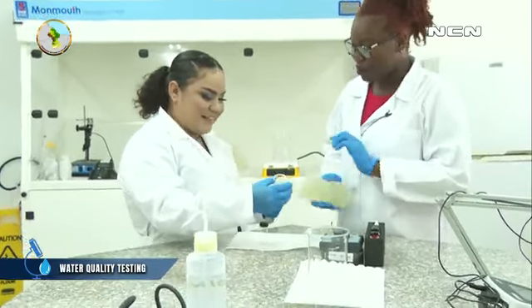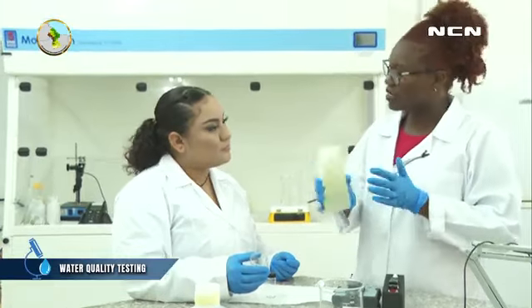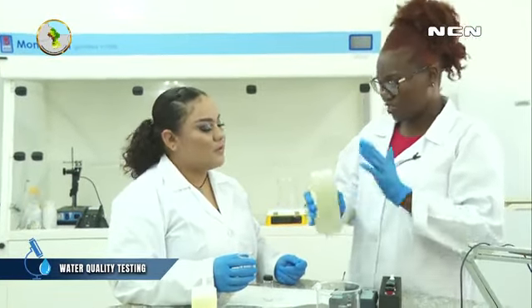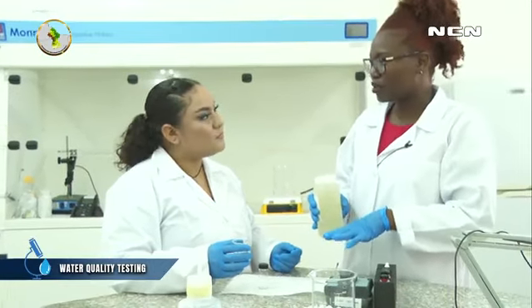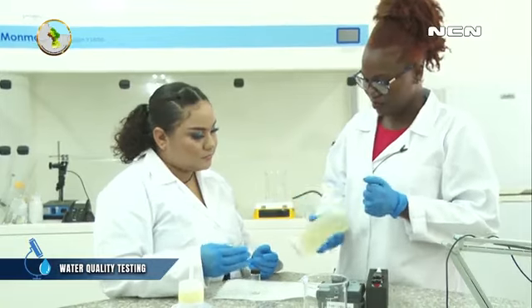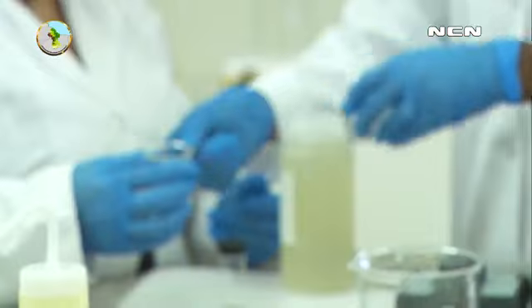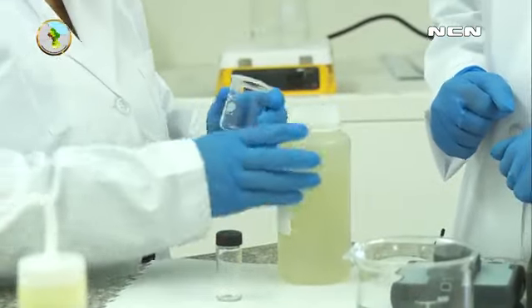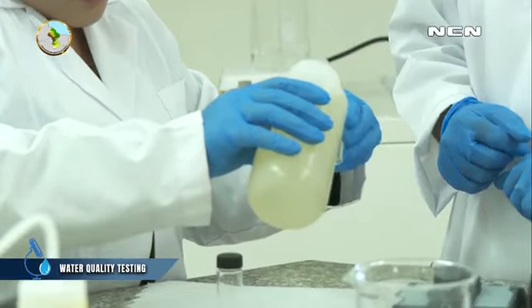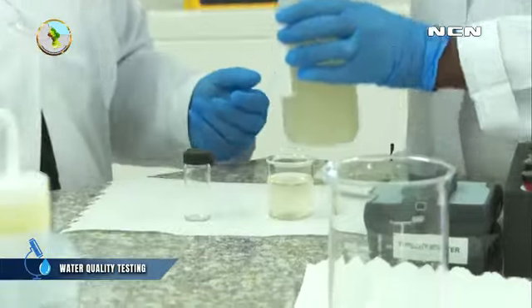Okay. So before we even throw out our sample, we have to ensure that we shake it up, turn it upside down to make sure that all of the particles are evenly distributed. Because if you let water settle, everything will go to the bottom, so we won't get a true value for that water sample. So you can throw it over, fill it up to 40. Great. So now we have our sample that we're going to be testing.